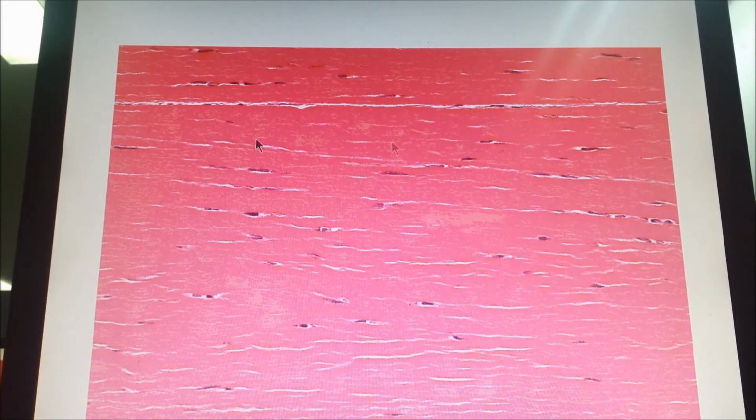All this banding is collagen bundles. They stain with eosin, they are in one direction. شو السيلز اللي بنشوفها between the collagen fibers؟ شو الخلية اللي بتصنع الكولاجين؟ It is the fibroblasts. But in case of dense regular connective tissue, the fibroblasts will become resting. خلاص ما ضلش space في tissue. It's filled with collagen, so the fibroblast will be resting. It will transform into a fibrocyte, the resting stage of the fibroblast.